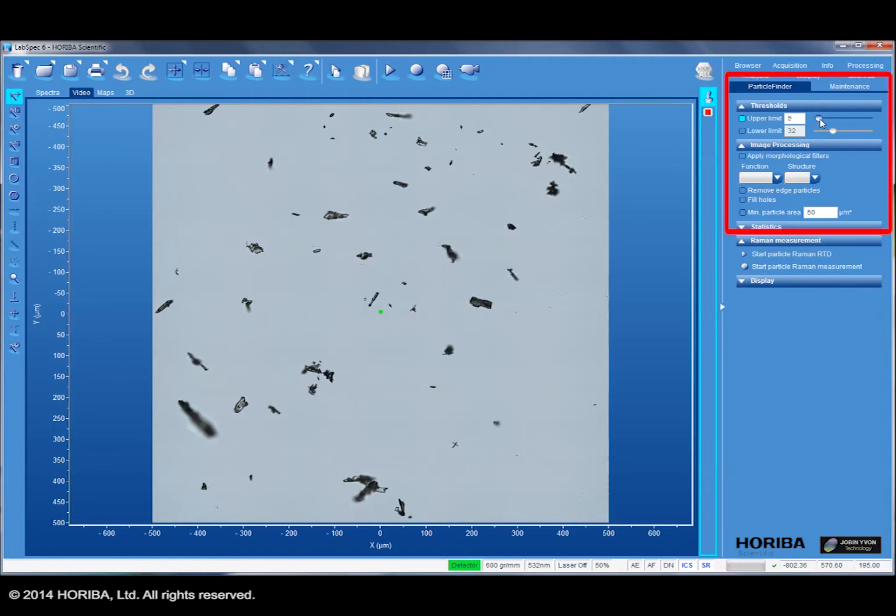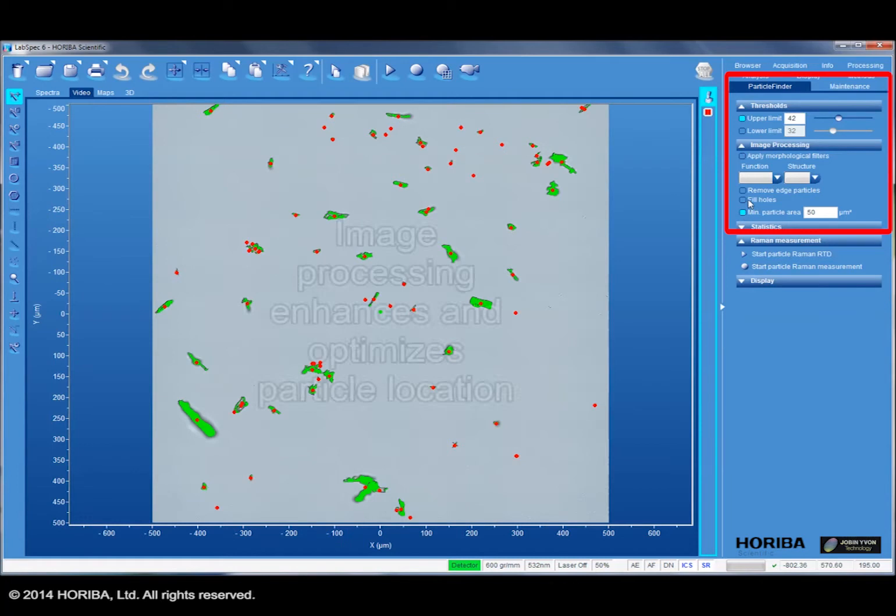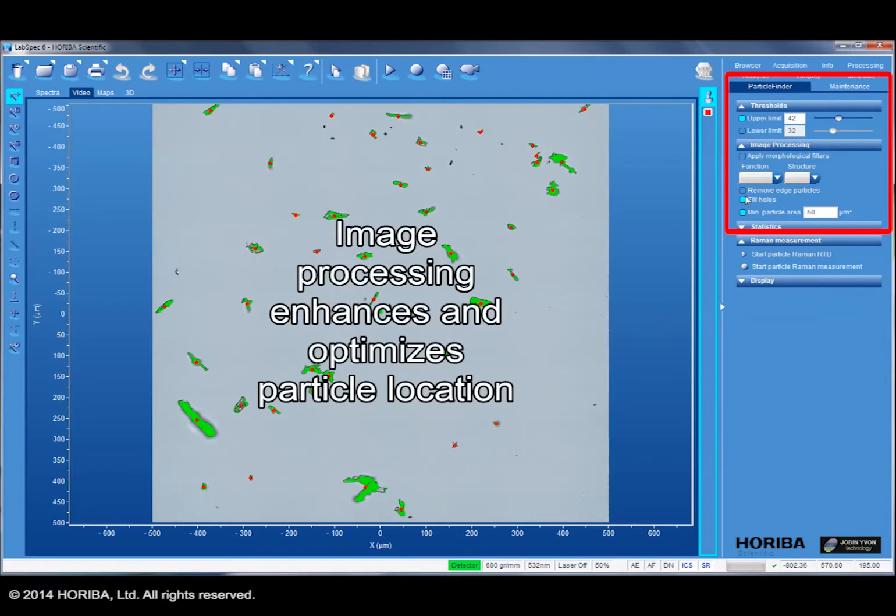Thresholding can be used to locate the particles. In this case, an upper threshold is used to locate dark particles on a bright background. As the slide is adjusted, more and more particles are identified. Morphological filtering and other image processing tools are available to optimize the particle location.